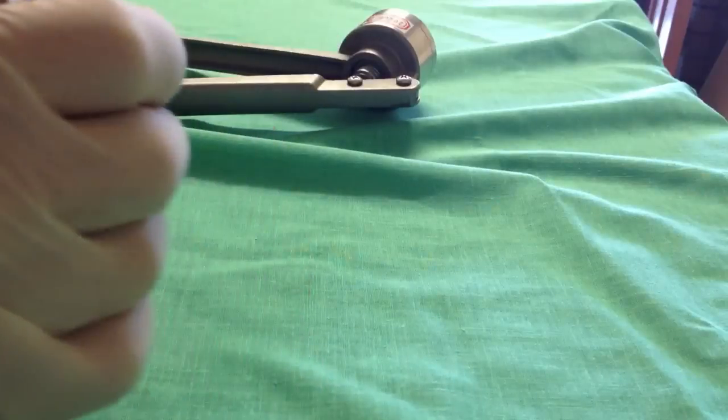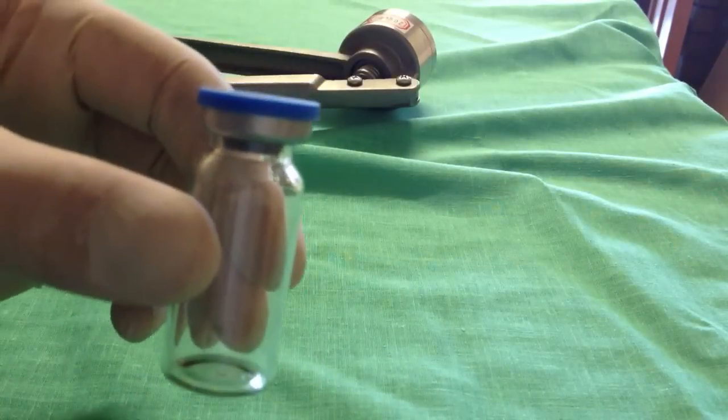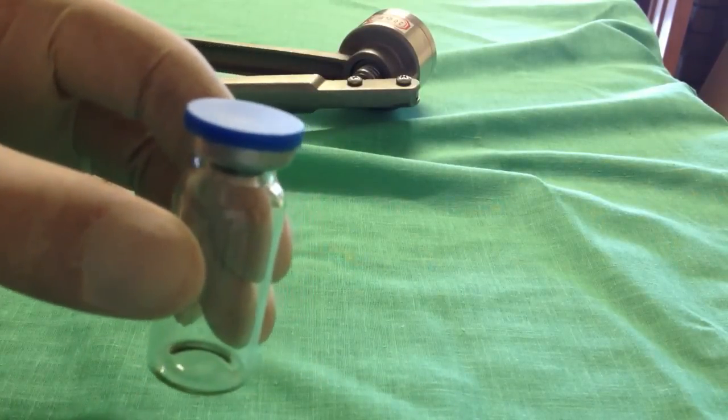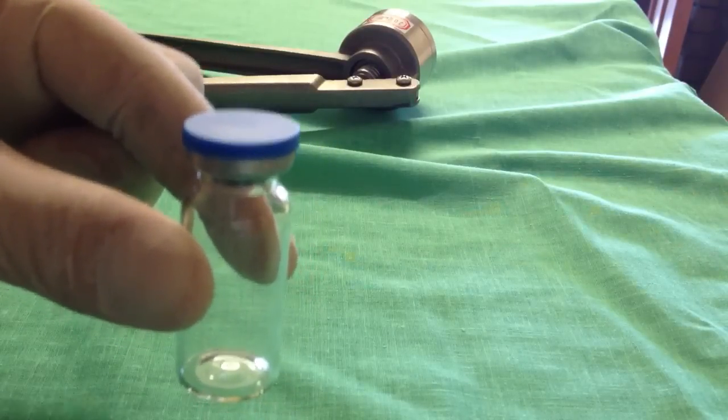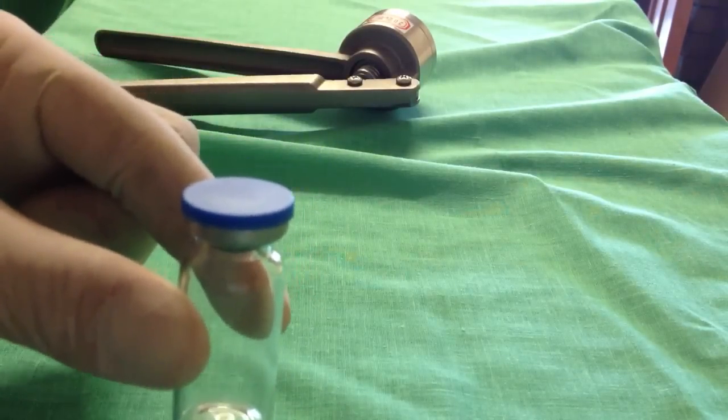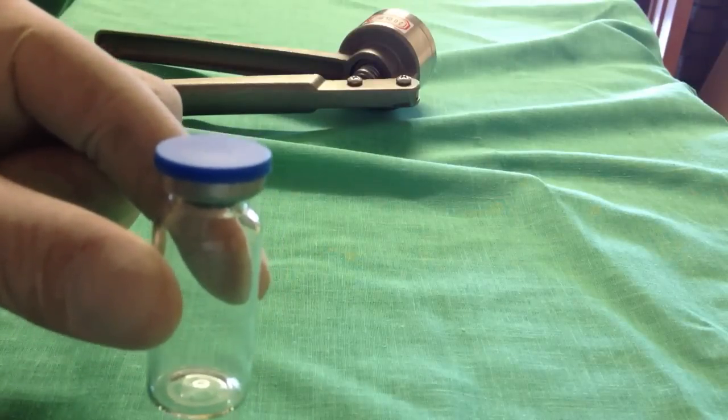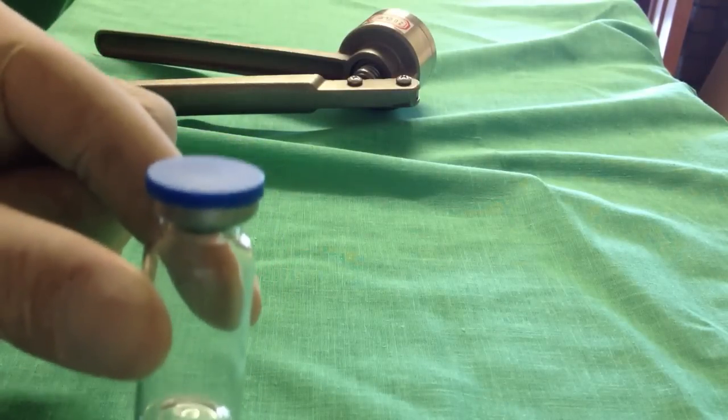And there you have the end result, which should be a fairly nice crimp. Now, most importantly, make sure, as I said, that when you put that cap on, it's leveled. Because if it's not, the actual crimper will crimp it unevenly and it might not be a tight seal.